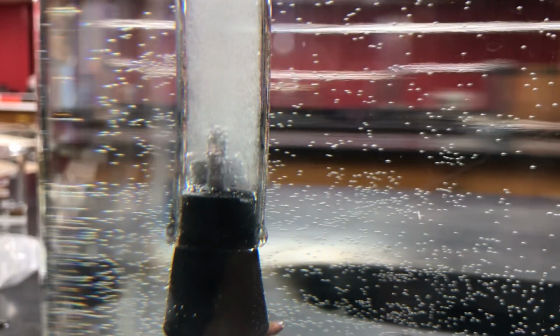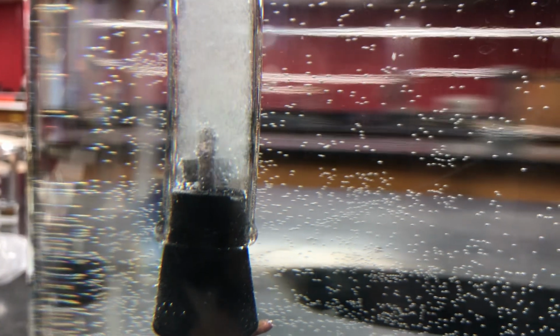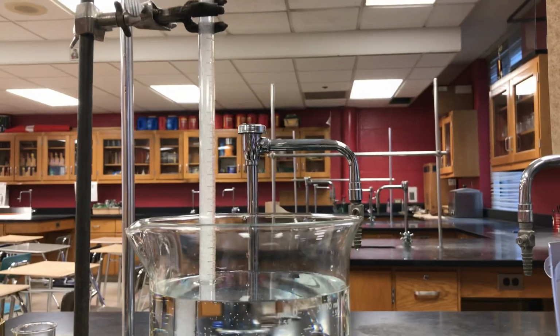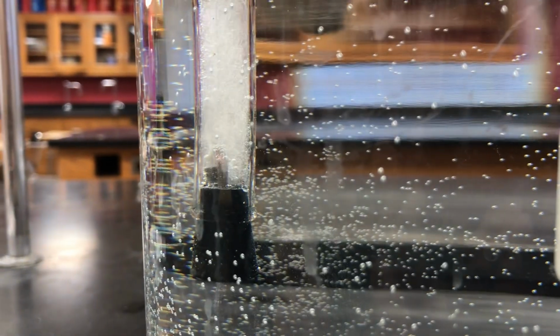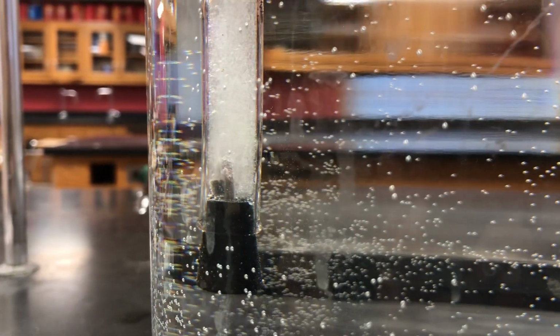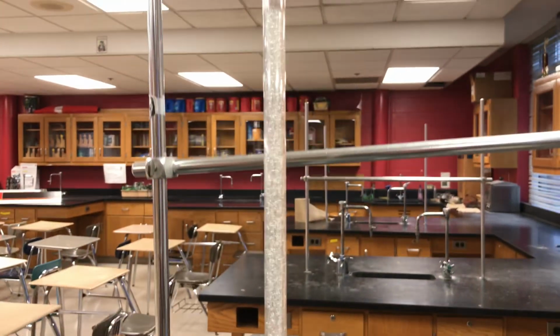So it'll start slow, but it'll begin to bubble. You can see it's kind of picking up now. And as most of the HCl makes its way down, it'll really get bubbling. Yeah, we're starting to collect some hydrogen now, for sure. How are we doing up there? A couple milliliters.